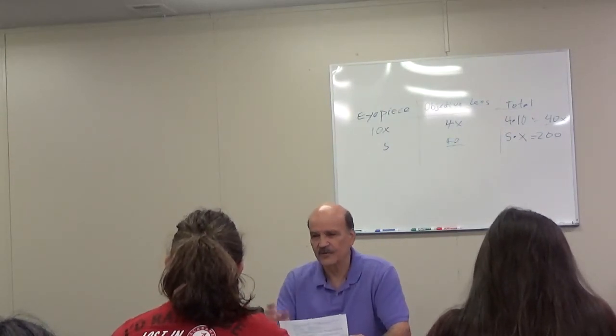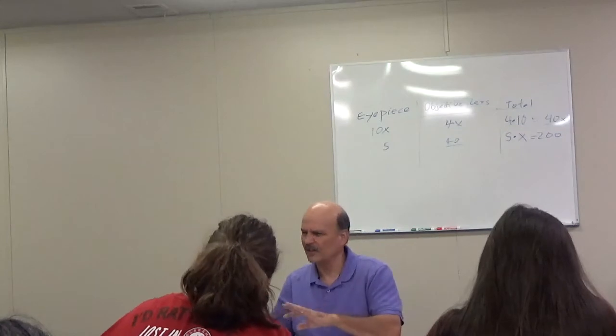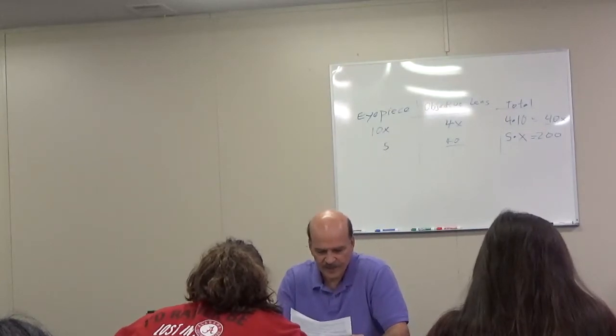And you should indicate to the right of your drawing the power that you use. This is what it looks like when you use 40 power. I think on all your microscopes you have 40, 100, and then 400. So indicate the power you looked at it. It's a good thing.